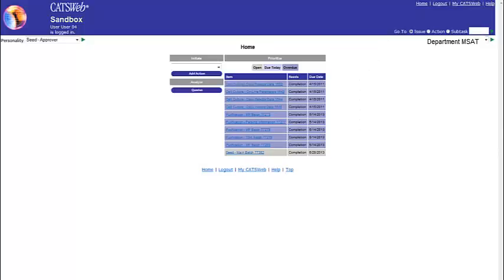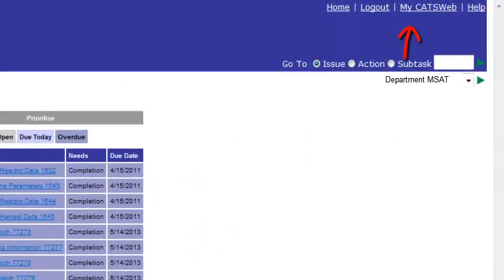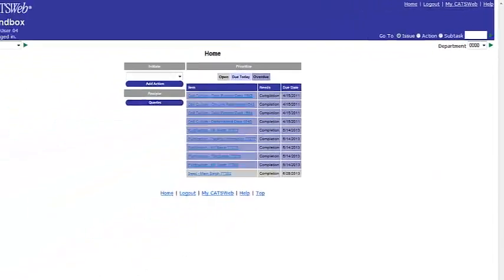For this exercise, we'll use the classic home page. However, if you work exclusively with cell culture, you may want to customize your default home page so that you are taken automatically to the cell culture home page.